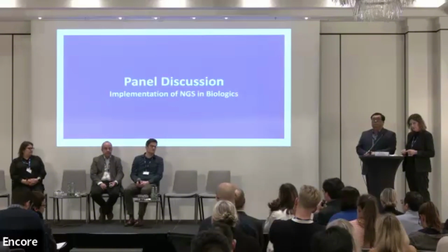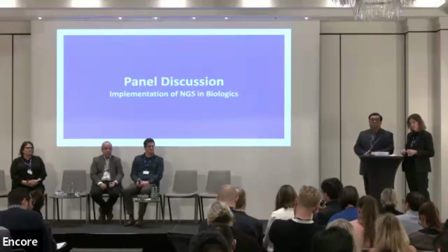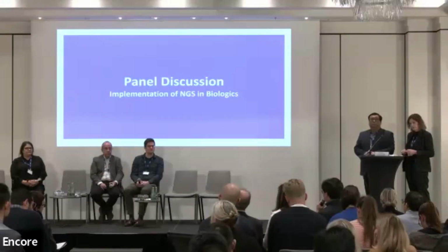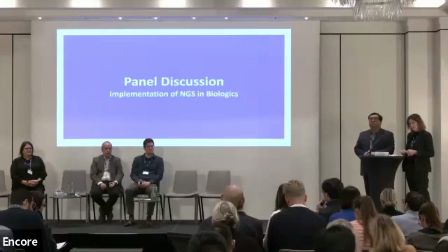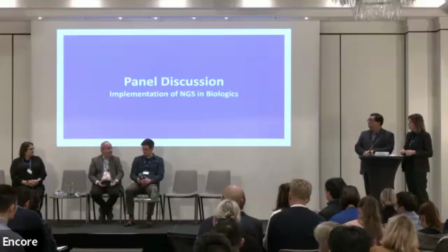pipeline. And the question for Robert is that I'm interested in knowing, my understanding is that you use the RefSeq as a k-mer seed to iterate the RVDB, but I'm not quite sure if right now the NCBI RefSeq has all of the viral taxonomies. If not, then if you use that as your k-mer seed, would that be a risk that you will miss the list? I will explain, but is one on?